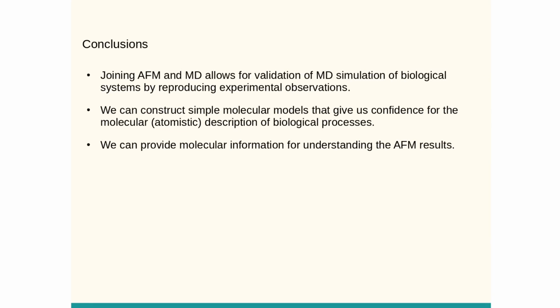Of course, once you get this validation, you can do a lot more comparisons. For instance, the rupture forces that you will see later on, that we measure in AFM, those are related to the interaction potential between the lipids and how this potential is affected by the presence of sterols. So we can go to more refined comparisons.